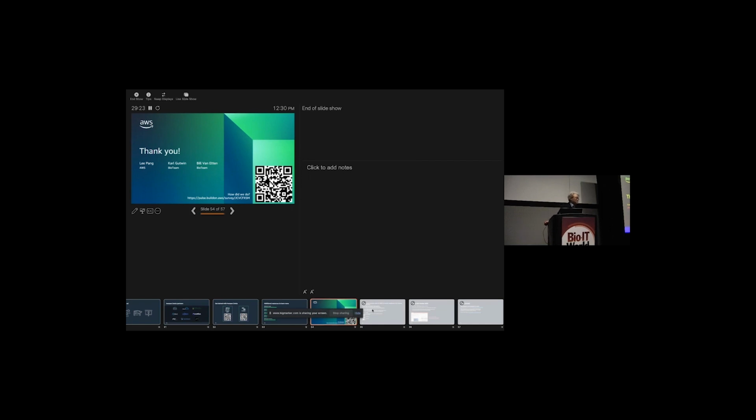For those ready-to-run workflows, I noticed you have tools like GATK or Sentieon. Do users have to care about their license? Yes, you do. With Sentieon, and any licensed ready-to-run workflow, you can bring your own license. If you have one, you can use that. The only thing you need to do is let Sentieon know. The process I'm aware of today is you contact Sentieon, they'll ask you for your account canonical ID, and there are instructions on how to get that. And then they can link that to your use case.